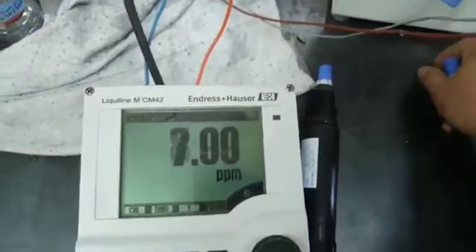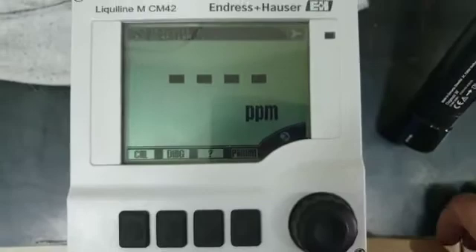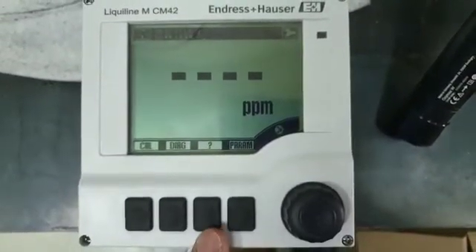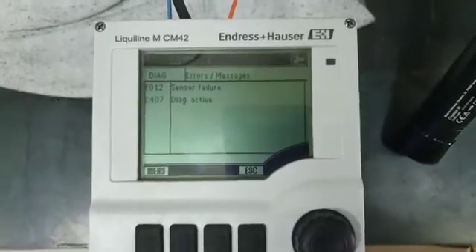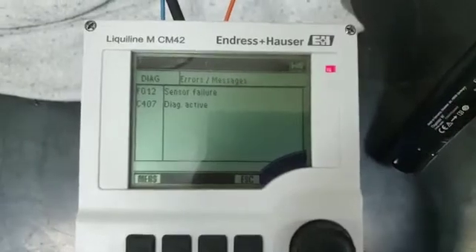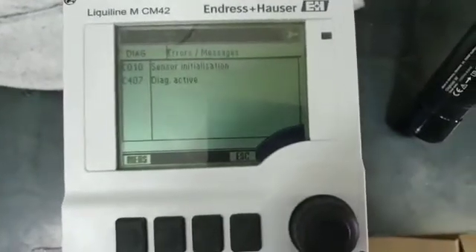One more try — I remove the working sensor and put in the new one which is reportedly not working. Same thing, same thing. No reading at all. I go to diagnostic — sensor failure appears, and the same red alarm is activated again. Then I remove it again.